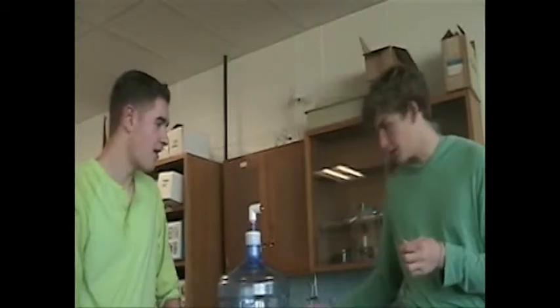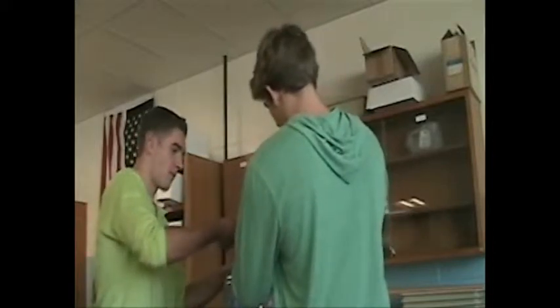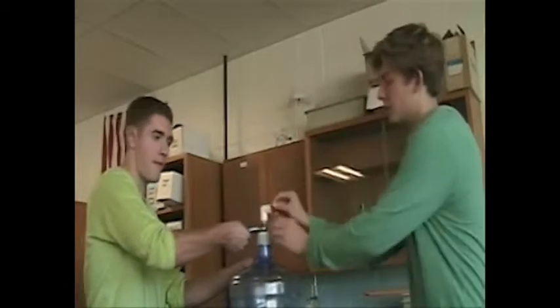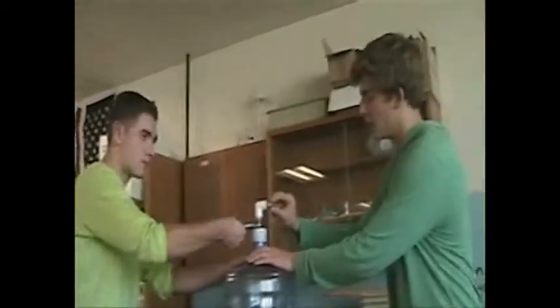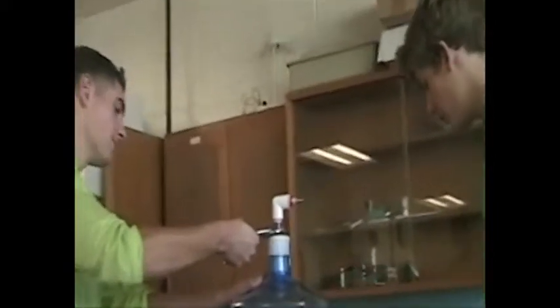We got some plumber's tape, going to wrap it around this thing. It's a 1/4 inch to 1/8 brass hose barb, and put some plumber's tape on there and make sure it's nice and watertight. And Noah and I are going to put this together again. Slide it in here. What this is going to allow us to do is attach a tube to this little hose barb right there, and then attach one of these.